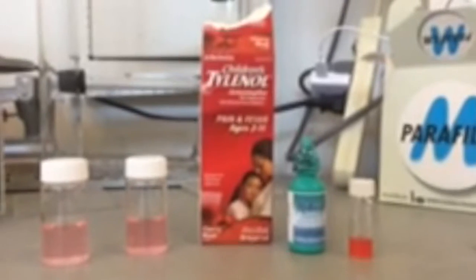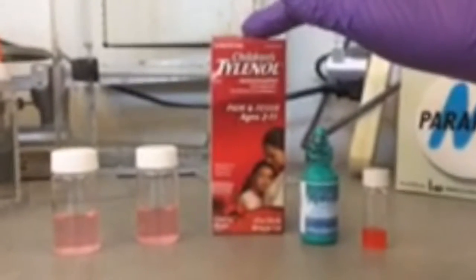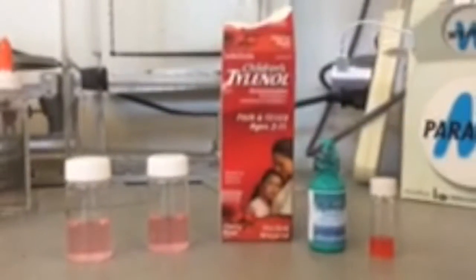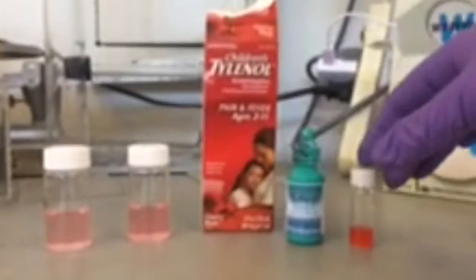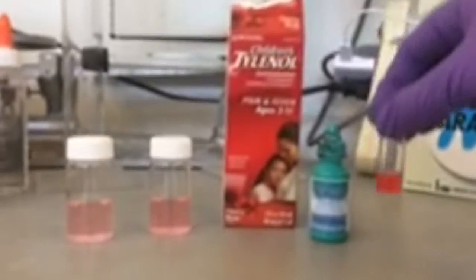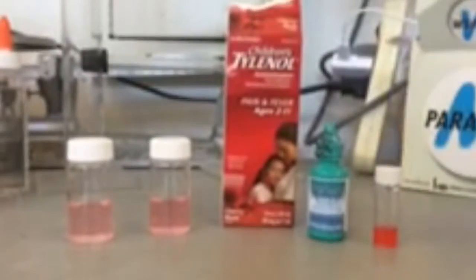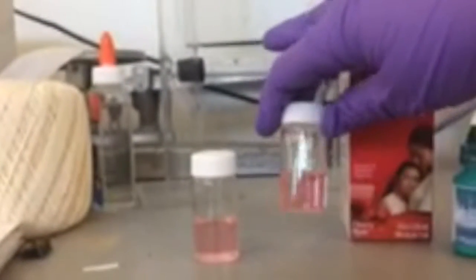We decided to perform CV on children's Tylenol to experiment with how various concentrations of acetaminophen affect the final CV graph. Here we have a saline solution used to wash contact lenses, children's Tylenol, a concentrated stock solution of the Tylenol dissolved in the saline buffer, and our two running solutions, one using 2 millimolar and the other using 4 millimolar acetaminophen.